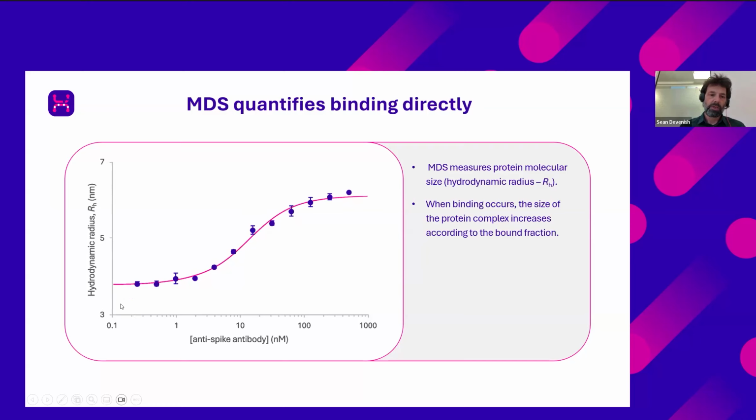We can see here that at this end of the curve, our fluorescently labeled particle is essentially on its own, or has no binding partner. As we titrate in our binding partner, this binding interaction increases until it saturates at the high concentrations of binding partner.